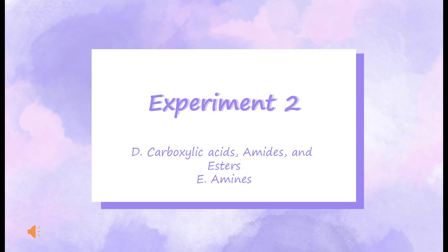So today I would like to present experiment 2, and the task that I've been given is task D and E. Task D is carboxylic acids, amides and esters, and task E is amines.